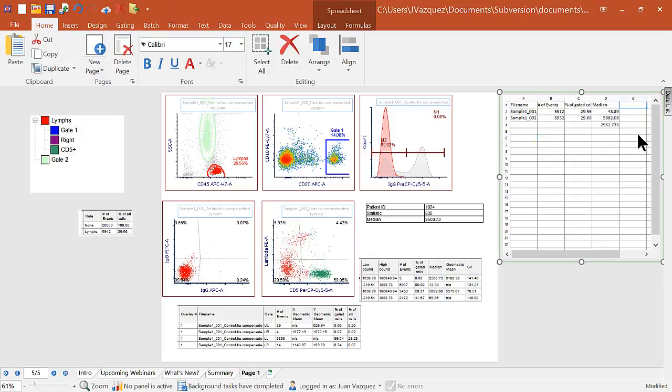Now let's say I wanted to create a ratio. I can just take a ratio here as well. For this ratio, let's say I want to take the ratio of this first number divided by the second number. I can just put in my equal sign. I can create my ratio just like I would in Excel, where I'll tap on the cell, the math sign, and then tap on the next cell and click enter, and I get my number. I can also copy and paste that to the next cell as well. Okay, and then when I double click on that, it'll show you the two cells that make up the variables for that particular statement.